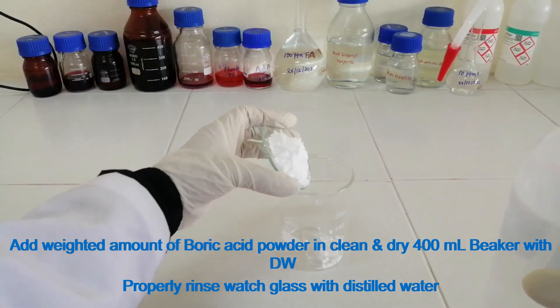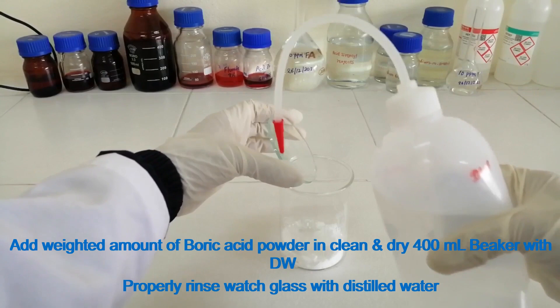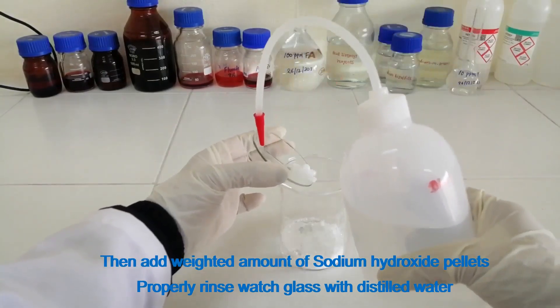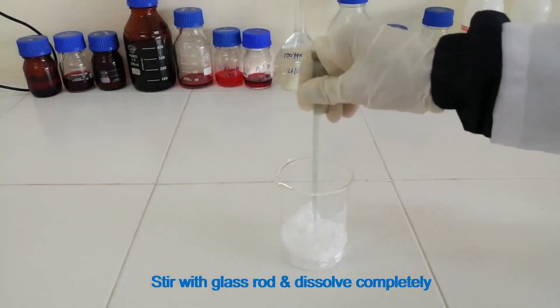Add the weighed amount of boric acid powder into a clean and dry 400 ml beaker with distilled water. Properly rinse the wash glass with distilled water. Then add the weighed amount of sodium hydroxide pellets and properly rinse the wash glass with distilled water. Stir with a glass rod and dissolve completely.